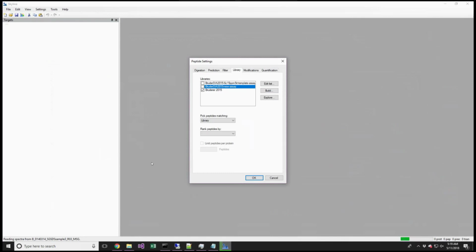Oh, actually, it's got to read. Oh, it's still reading the spectra pretty quickly. It's processed the search results, and now it's reading spectrum files. But yeah, they're going to be raw spectra, right? And then that gives you a lot more flexibility. And now it's filtering. That might take a while. Okay. Well, we can come back to this.